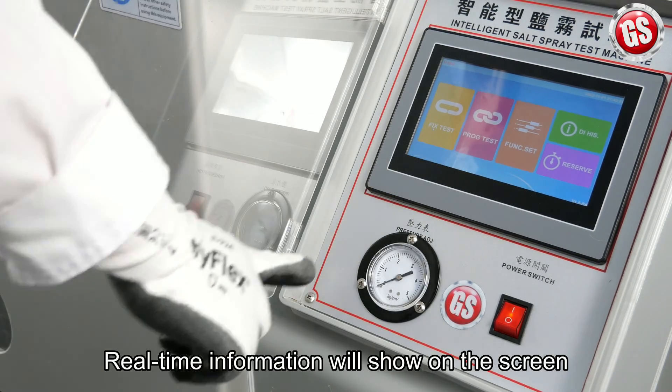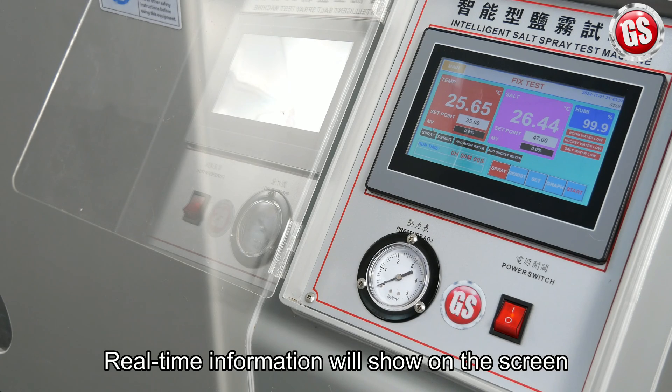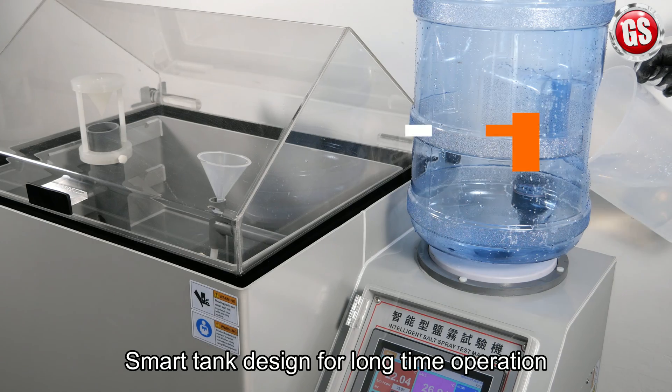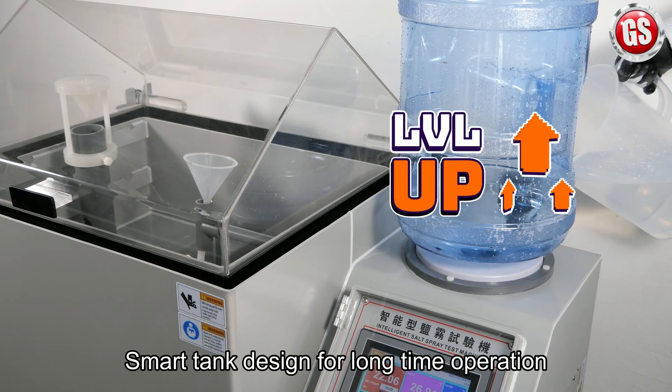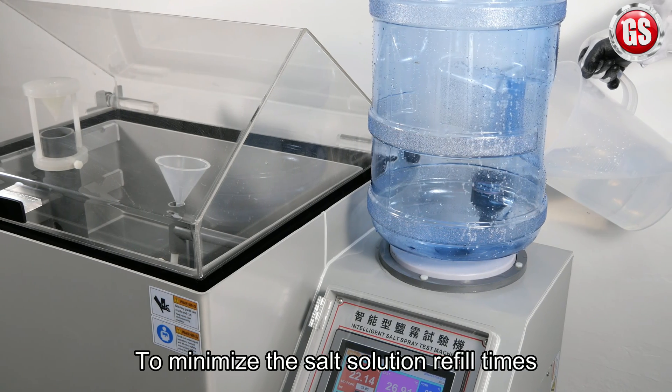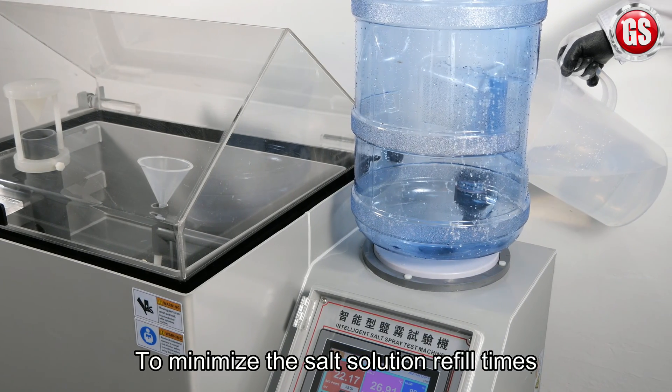Real-time information will show on the screen. The smart tank design is made for long time operation to minimize the salt solution refill times during the test.